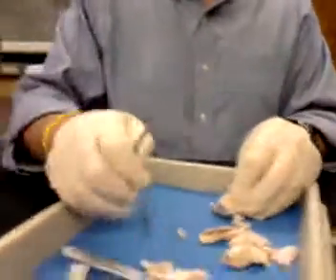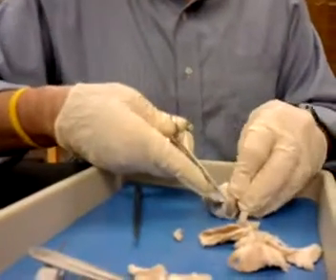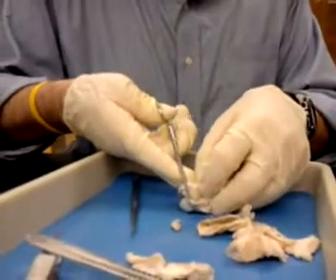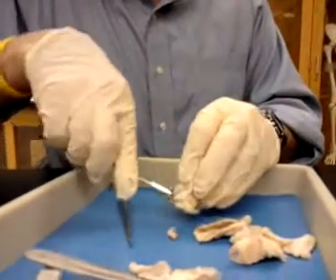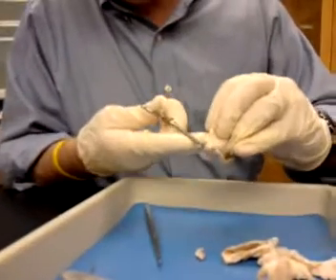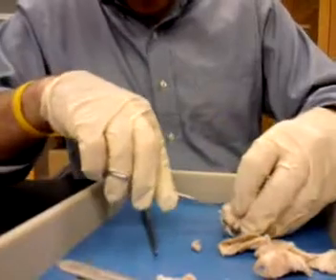You don't need the scalpel anymore, because then you can just take your scissors and cut around that. That's the aqueous humor? I'll show you in a second. Part of the reason why you're holding this down like this is so that you don't take the lens and dislodge it.